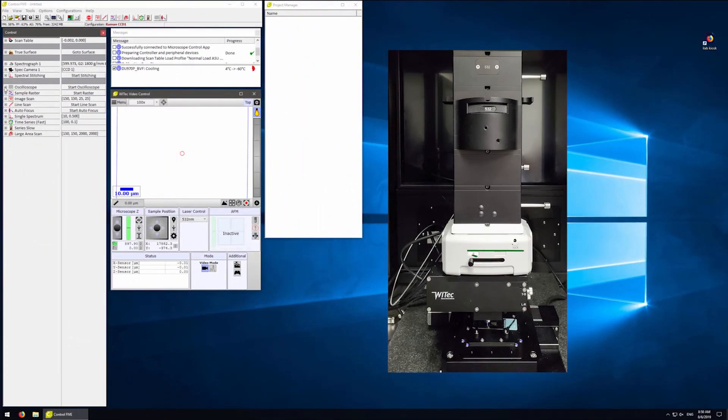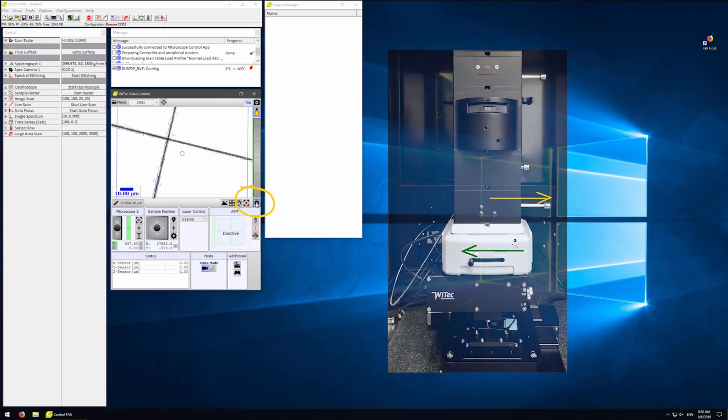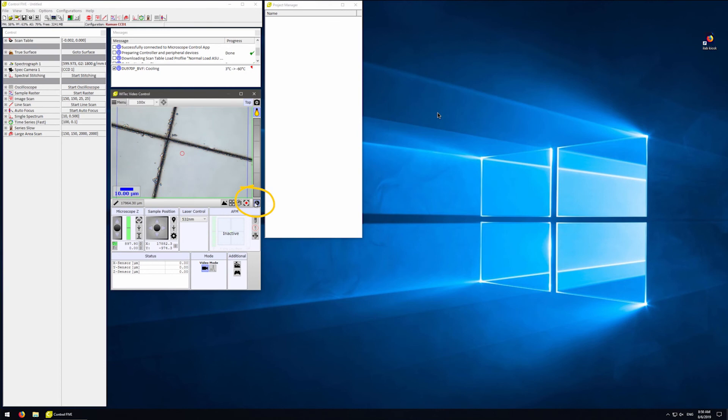Move the swing arm to the left and pull on the silver lever to go to optical imaging. Click on the Auto Brightness icon. You can now see the sample if you're focused.